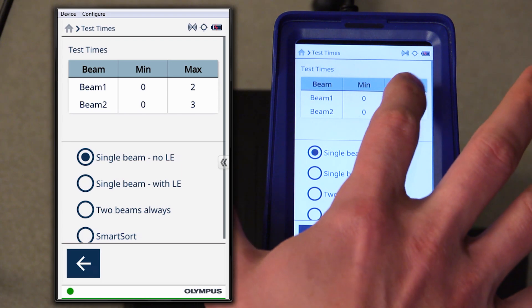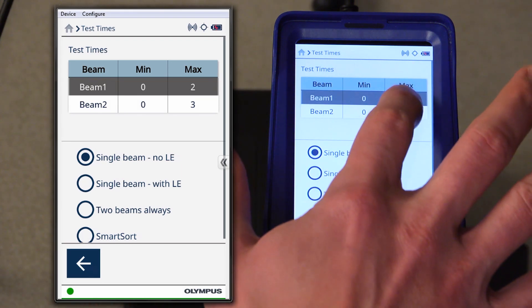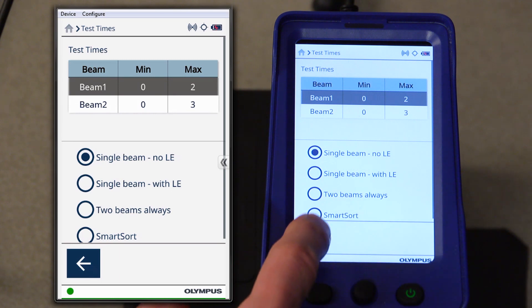Selection of the proper test time is done by selecting the beam one maximum time. For beam one elements, which are titanium and up on the periodic table, we want a test time of approximately less than five seconds or so. A beam one maximum of two seconds should be adequate for our weld testing.